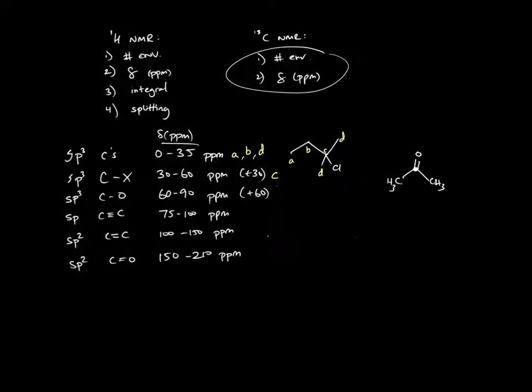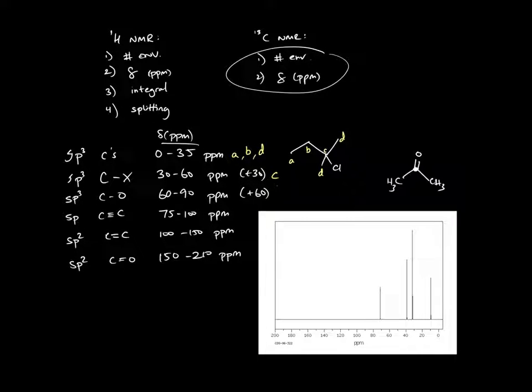So let me grab the carbon NMR of this guy. So you can see from that carbon NMR that things are a little bit higher than we predicted, but that's okay. They're in those rough regions. So you can see that environment C is right here. Oh, that doesn't show up very well. Let's try pink. So environment C is right there. That's the carbon that's directly next to the chlorine.